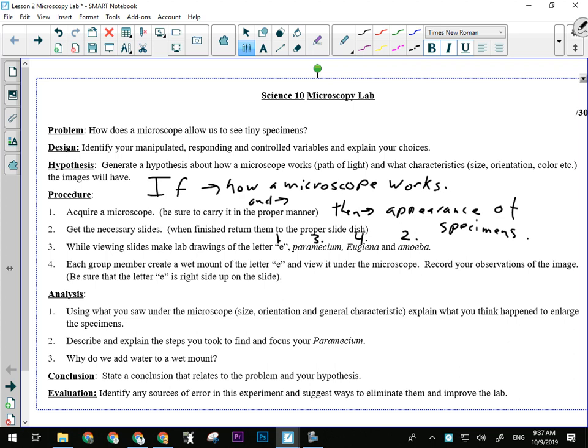You'll put the amoeba under the microscope and find it on scanning power, focus, center, go to low power, focus, and center. You are going to do your lab diagram of the amoeba on the low power lens. It is a fairly large microorganism. If you try to get it on high power, it'll take up more than the entire field of view. The other problem with the amoeba is that because it's so large, it's got enough depth that you can't focus the whole organism at one time.